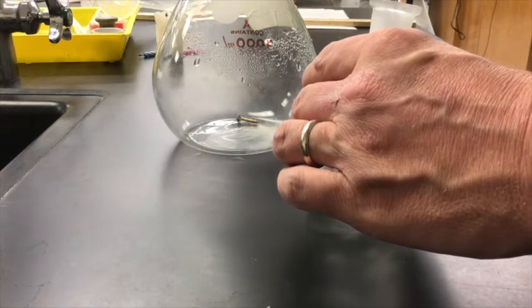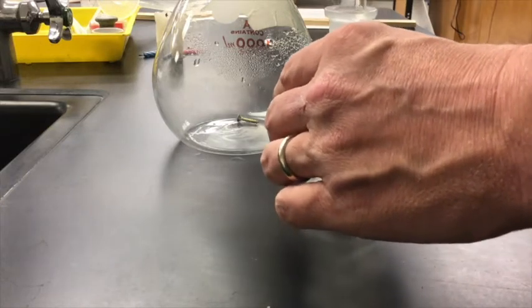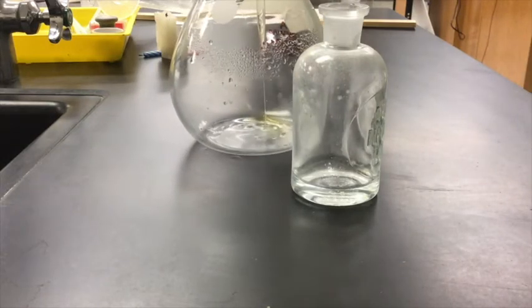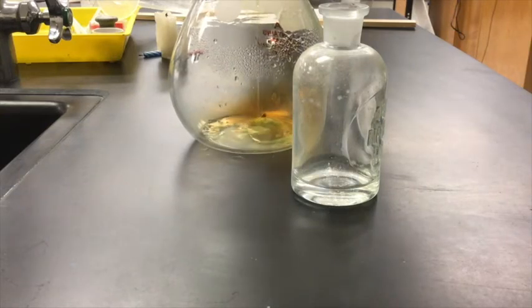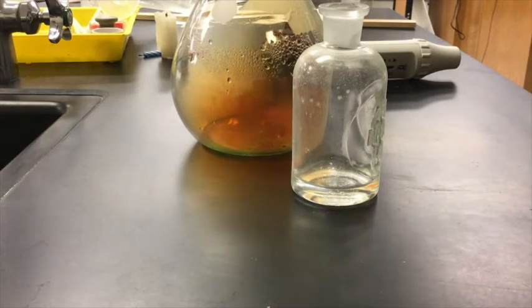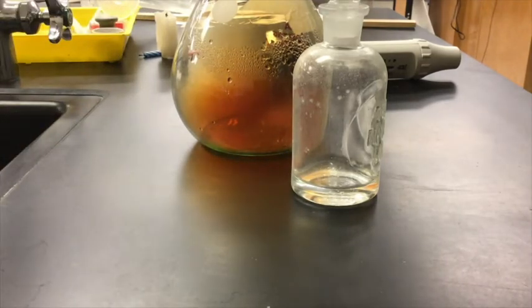So in it goes. There's my 5 milliliters. I don't have to be exact on this, but I just wanted to be in the neighborhood. And then I'm going to go ahead and pour this in here. And immediately this is going to start to react, and it's going to put the nitrogen oxide there into the air. You can see that that brown yucky gas is already beginning to form, and that is not good for anything.